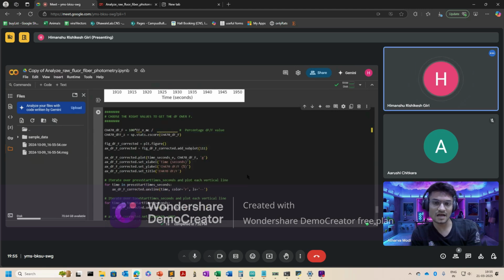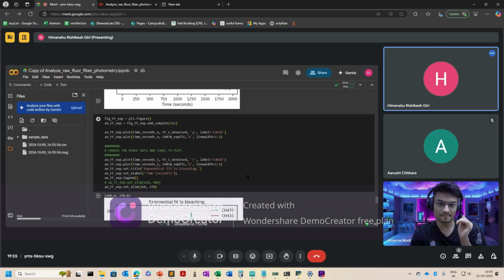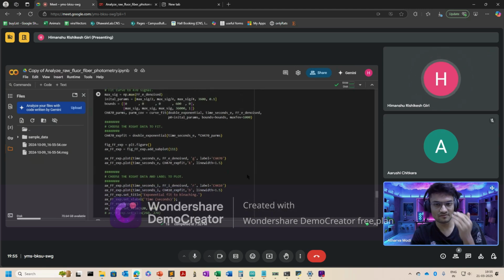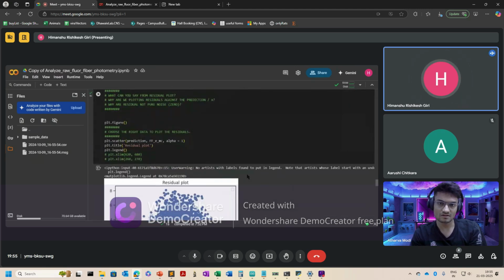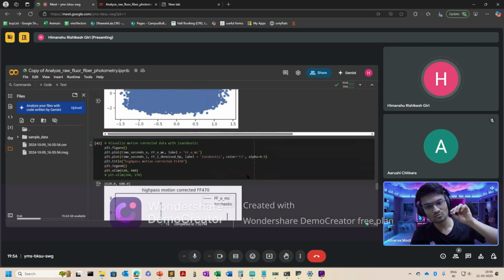You can also take DF from the exponential, but a better way to do DF is high pass filter. But that DF has some element of movement artifact, so we correct for movement in this artifact step, already using ISO. So that is actually DF corrected.